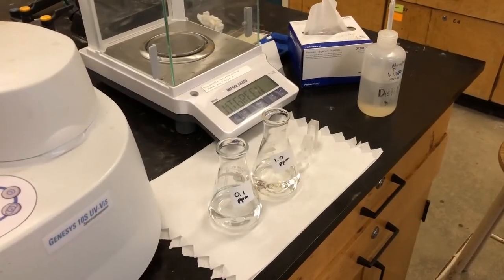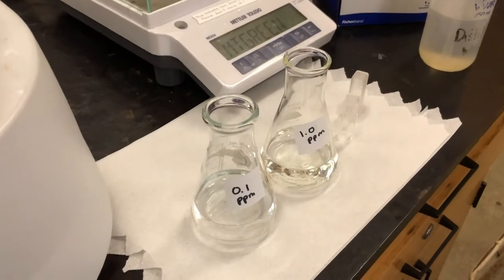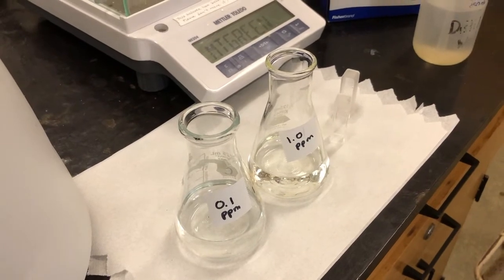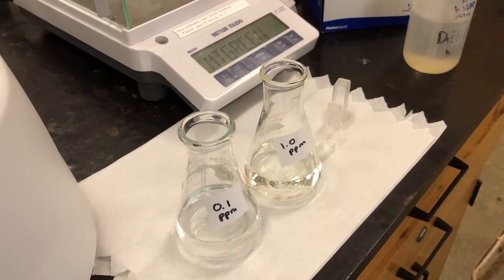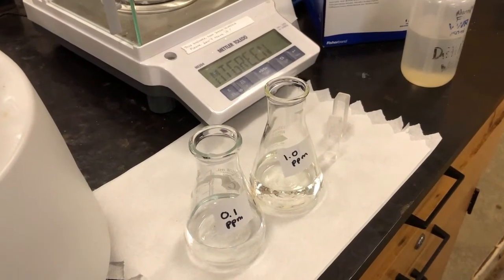Okay, so we're ready to measure these on the spectrophotometer, and you may notice that you don't see any color this time like you did the last time. And that's because the measurement for nitrates is in the UV range. So the nitrites was in the visible range, which means we can actually see it, but in the UV range we can't see it, but the spectrophotometer can. So we're going to start by measuring the 0.1 ppm, and then we'll do the 1.0 ppm.